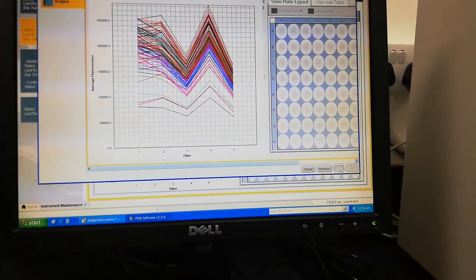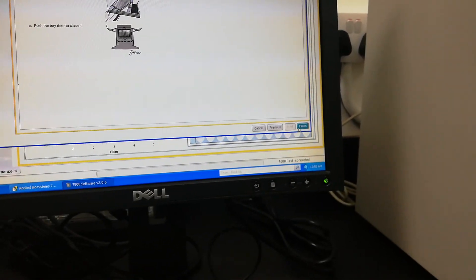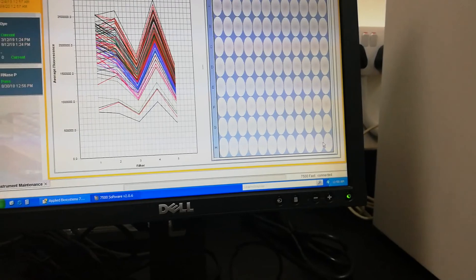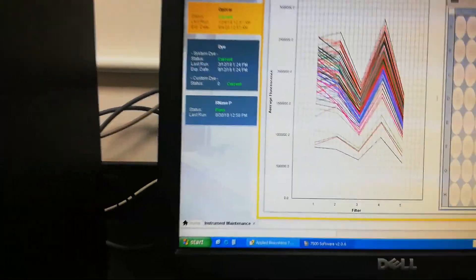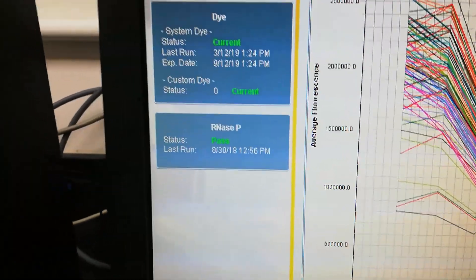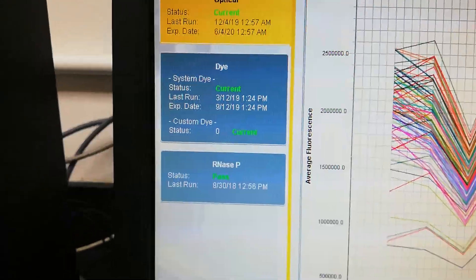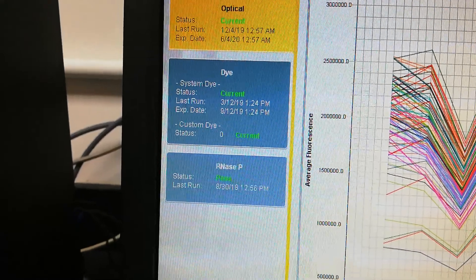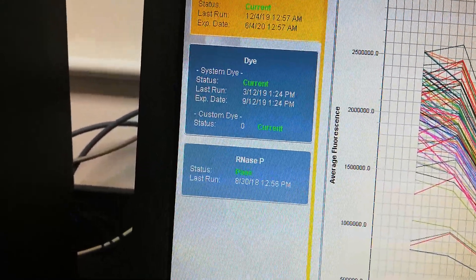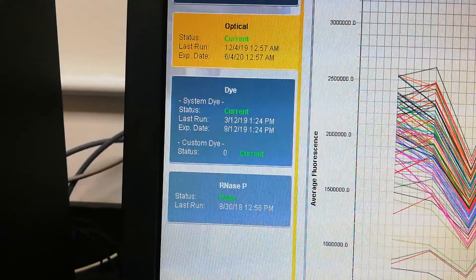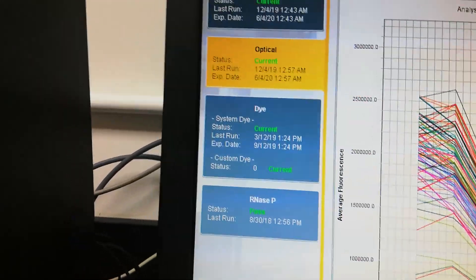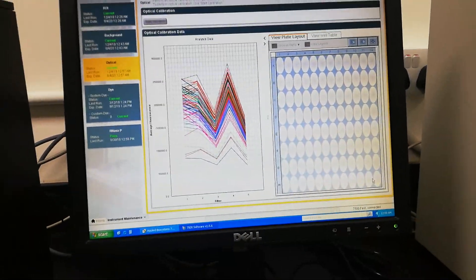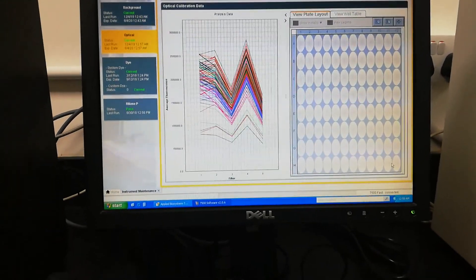Just take out the plate. Next, next, and press finish. Here it will show the update. Today is 4th December, so the next calibration should be done before 4th June 2020. This calibration is valid for 6 months.